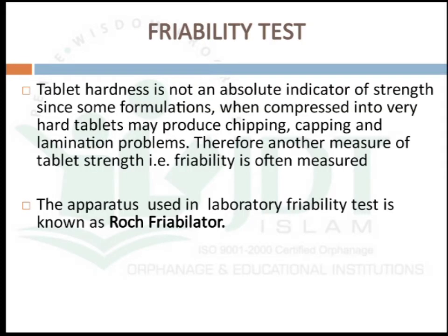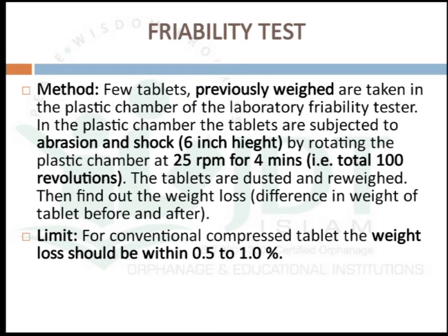Now coming to the third quality control test, the friability test. Hardness is not an absolute indicator of the strength of a tablet, since some formulations, when compressed into very hard tablets, may also produce chipping, capping and lamination problems. So for detection of these problems, we have to perform a friability test. The apparatus used for this test is known as the Roche Friabilator.